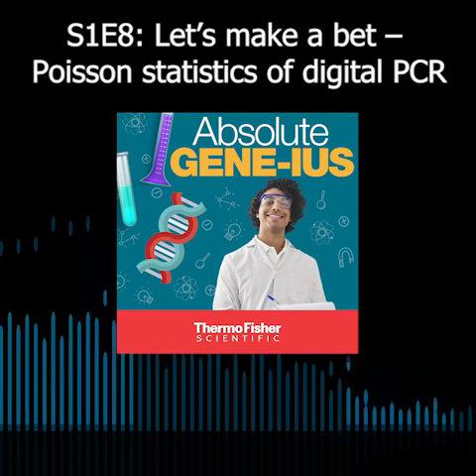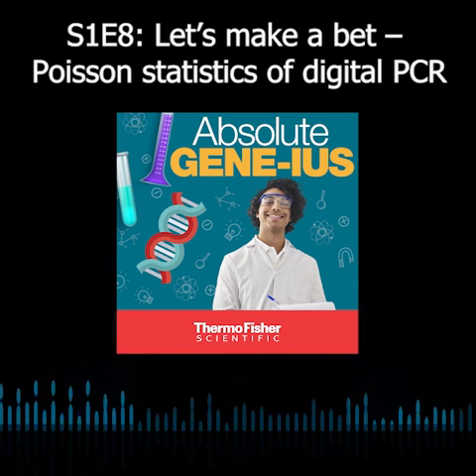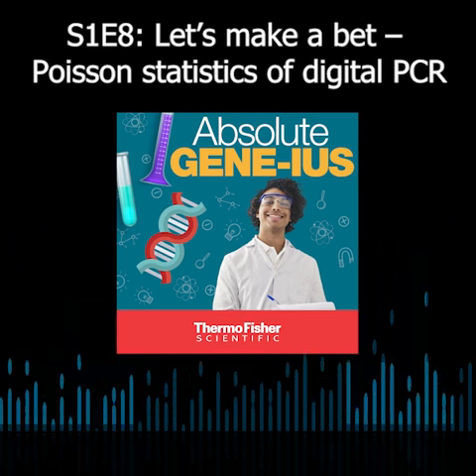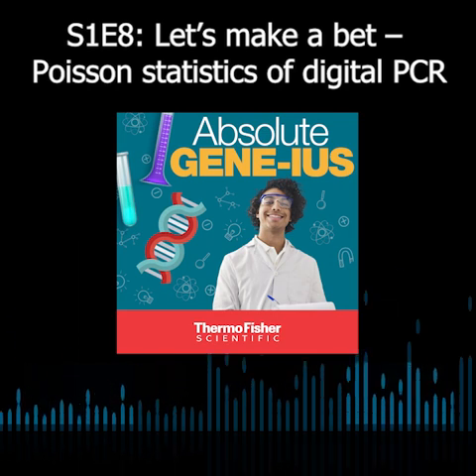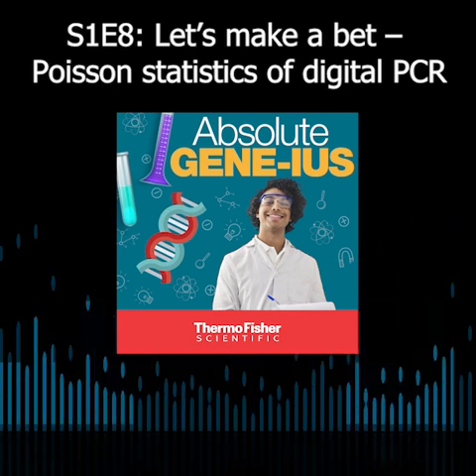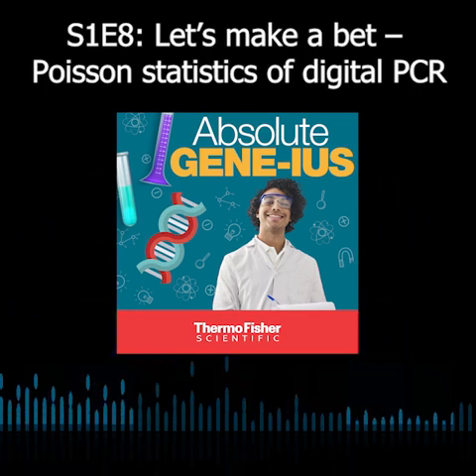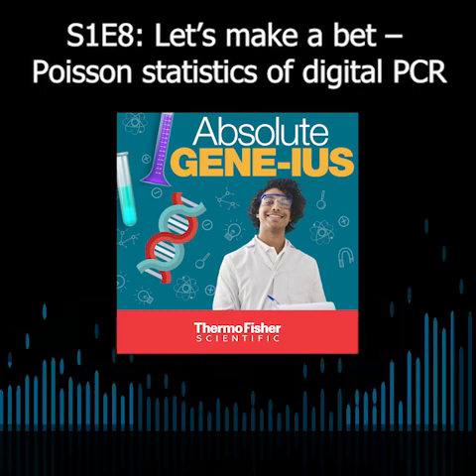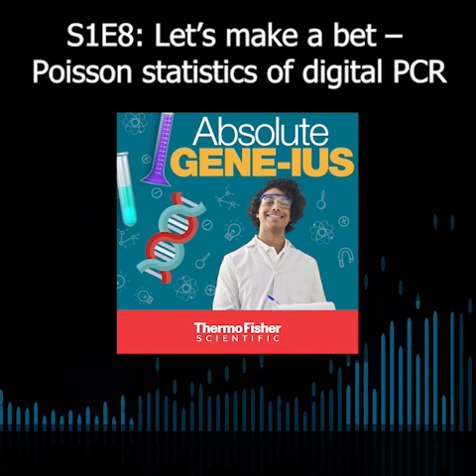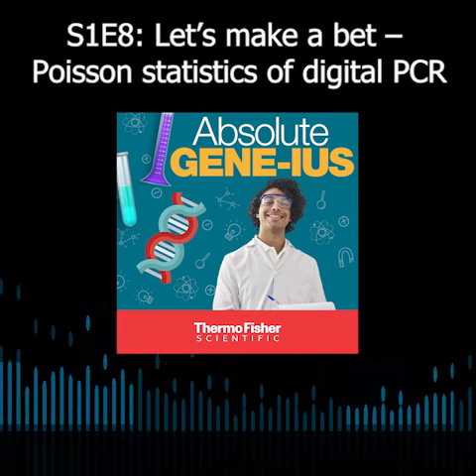Generally, if you're doing digital PCR, it is not a good assumption to assume that every chamber that has signal, counted as a yes, means that you have one and only one of your DNA target there. It's definitely possible that you're going to have 1, 2, 3, a couple. And the thing is, you can't distinguish that. So all you know at the end is that chamber was bright or not. And so personally, I always cringe a little when I hear people say digital PCR is counting molecules, because we really aren't doing that. We're not actually capable of it.